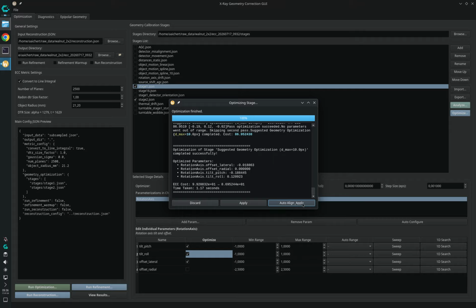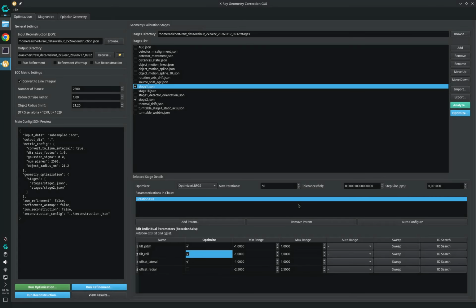Now this is new. What it does is it actually applies a global 4x4 homography that is also a similarity that tries to align the central plane before and after this calibration correction. And this is because if you change the trajectory, that will also change where the central plane is positioned in the reconstruction volume. And in order to really compare two images, they should be sort of registered, so they should be in the same position.